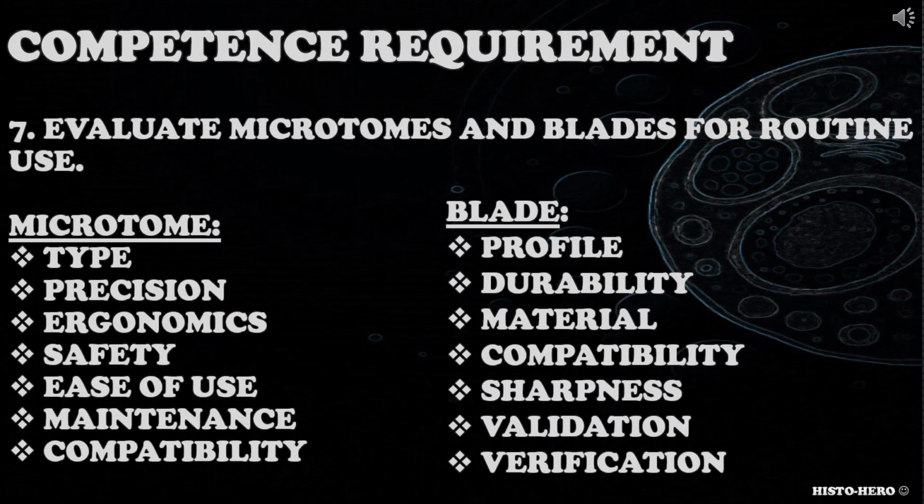When addressing this competence requirement, candidate could consider type of microtome used, precision, consistency, ergonomics, safety, ease of use, quality, regular maintenance, sample compatibility, and so on. As for blades, candidate should consider blade style, durability, material, sharpness, compatibility.